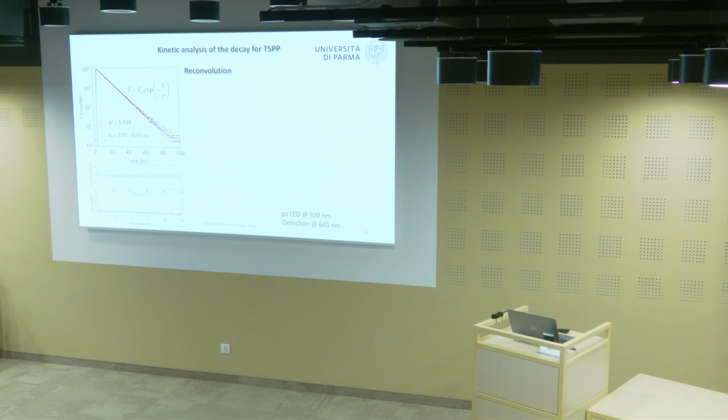Let me make a note. This is not the numerical error bar. If you were to use the numerical error bar, it would be much smaller, maybe 10 times smaller. But the numerical error bar has no meaning. If you want to know the error bar, do the experiment many times. That's the only way you can estimate the error bar in your system. Repeat it.